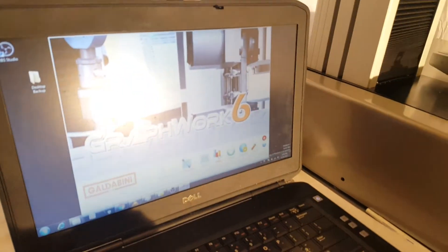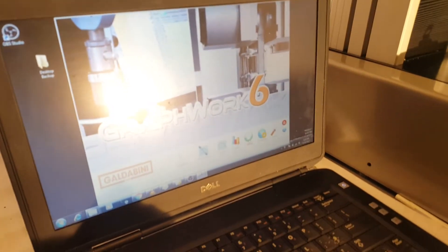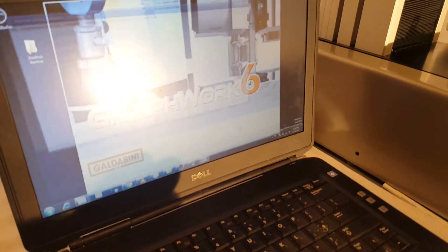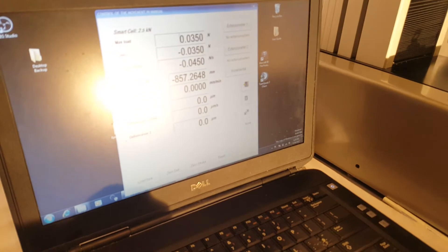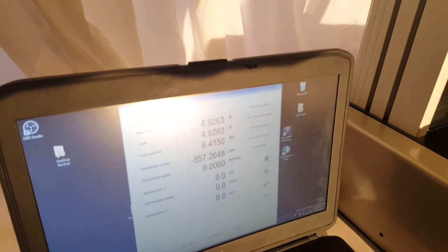Today I'm running the Graphwork 6 software — this is Galdabini's software. I'll go into manual mode here. Here we can see all the key measurements of the machine. If I pull on this a little bit to increase the load, you can see the load goes up here.